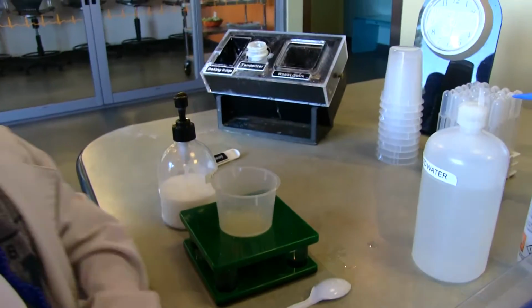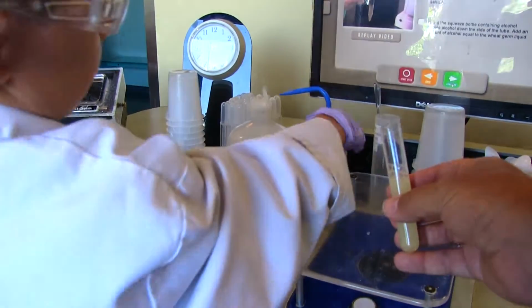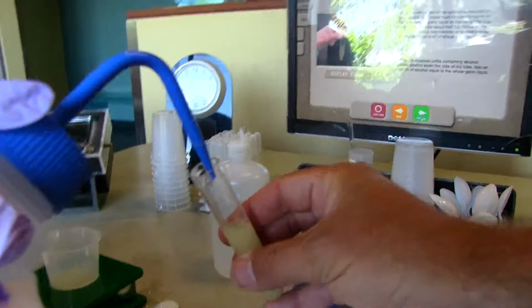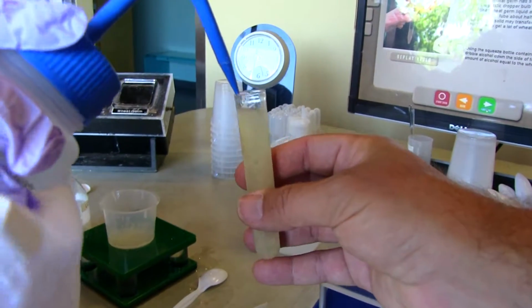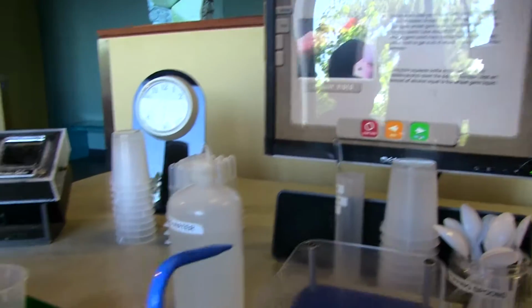2. Okay, now we want to add some alcohol solution. Can you put some of that in here? Okay, now put it just down the side of the tube. Okay, squeeze it. That's enough. There we go. Then what do we do? Okay, hit the white button.